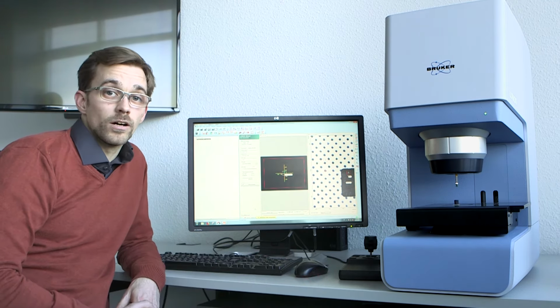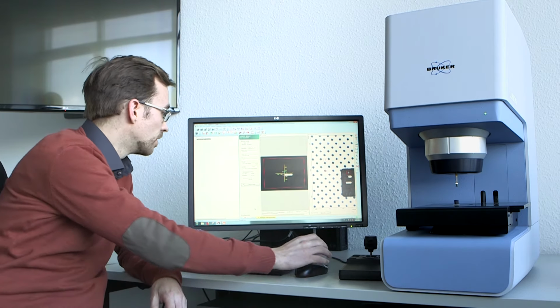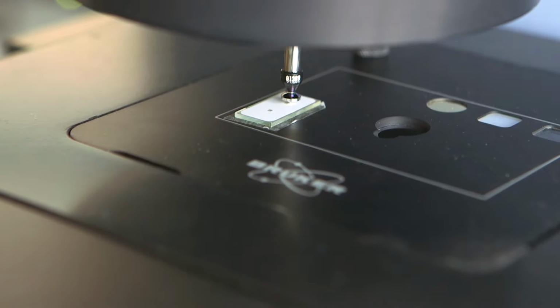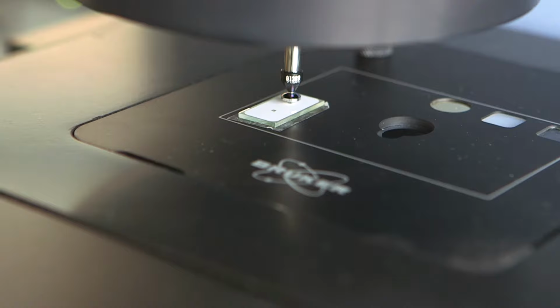Lastly, you can once again optimize your measurement settings, like measurement time and sensitivity, and all that's left to do now is click Measure Sample. Because the LUMOS has an integrated pressure sensor, the surface and the pressure of the crystal on the sample will always be the same, so you get reproducible results every time you measure.